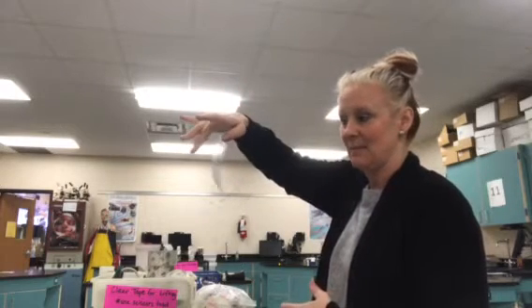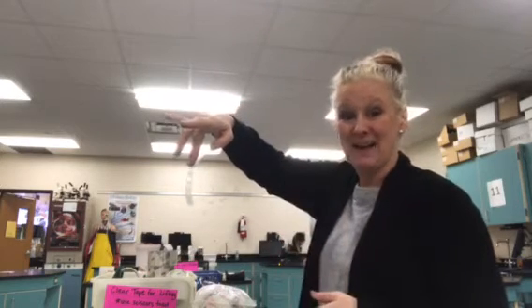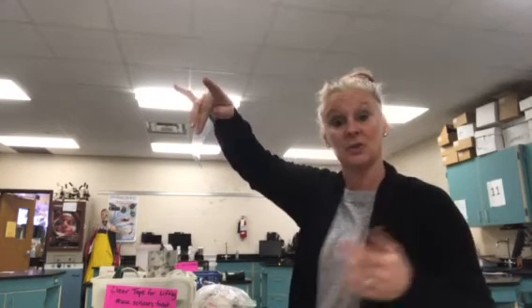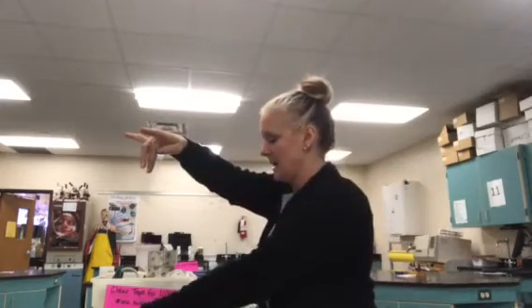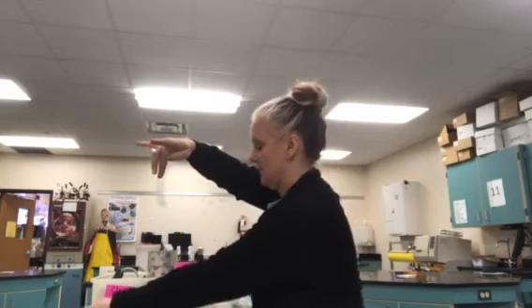Now, the trick is, this is staticky tape. Look what happens when I bring my finger close to it. If you don't want the tape to peel back on itself, stick your finger towards it, and that will control the end of the tape until you're ready to do something with it. The next step is to make sure that you have a piece of spot paper, and those are in this small blue basket here, right by the clear packing tape. So you're going to want to pick up one of those spot papers.